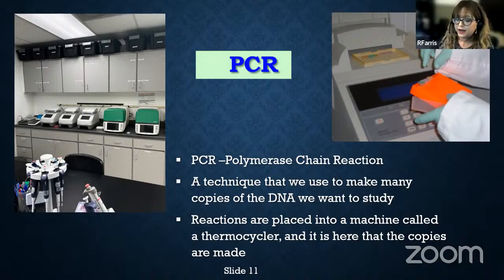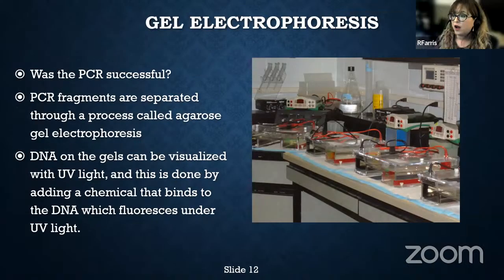of our DNA. And so the next step is, well, how do we know whether or not our PCR was successful? Because up until this point, everything's invisible. And so you're basically going by faith. And so when you take your reactions out of your thermocycler, they're going to look exactly as they looked before you put them in, which basically just looks like a little bit of water. And so not much has changed as far as you can tell.